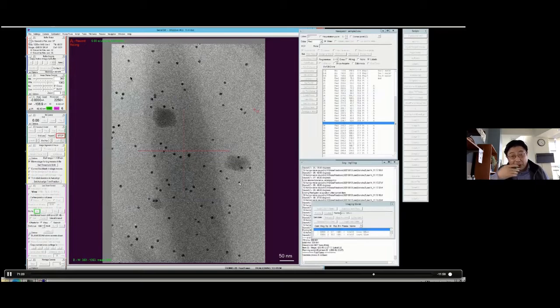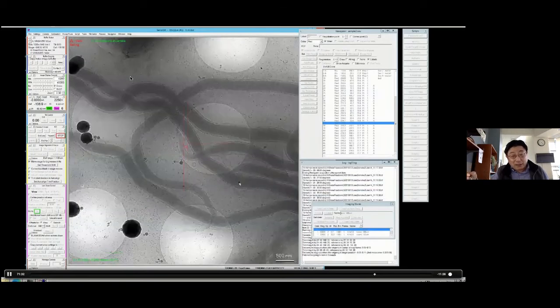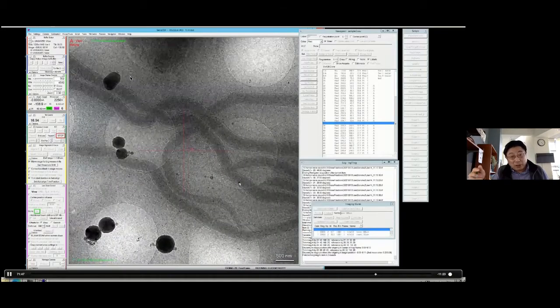I think I already told you a couple of key messages. One is you really need to be involved in selecting your target. And you also need to get feedback quickly, so you know whether what you selected is a good target. Sometimes it's trial and error. And including one of the previous questions, the gold concentration is the same, but the gold is not evenly spread. Sometimes some areas have more gold than others.